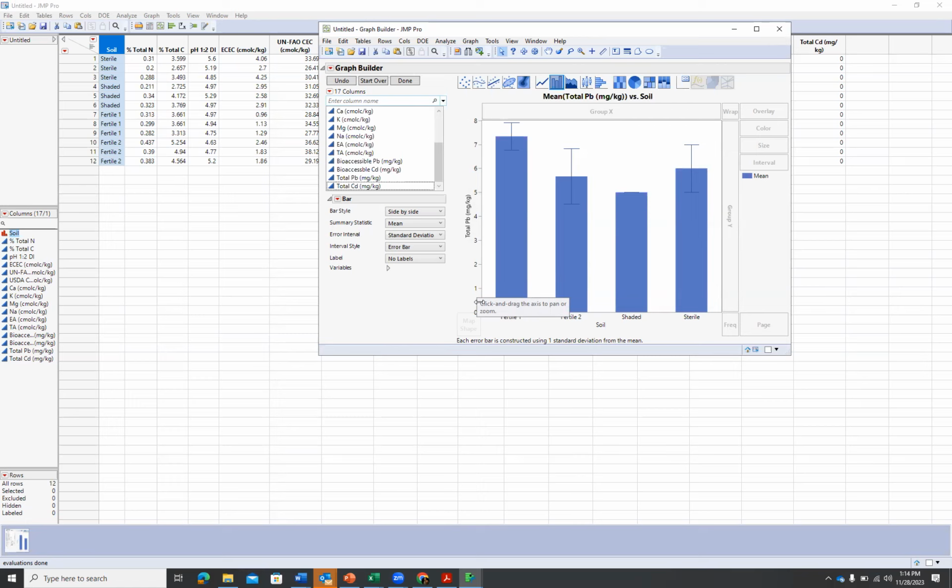Right, all the variables that we looked at and determined during the quarter for our Costa Rica soil, those ones have some kind of relationship with the grower's classification of the soil's fertility status or the soil's health status. Oh yeah, magnesium. Let's look at that.